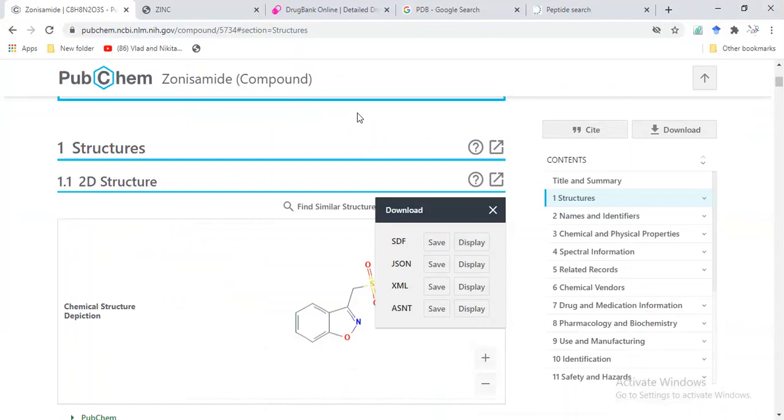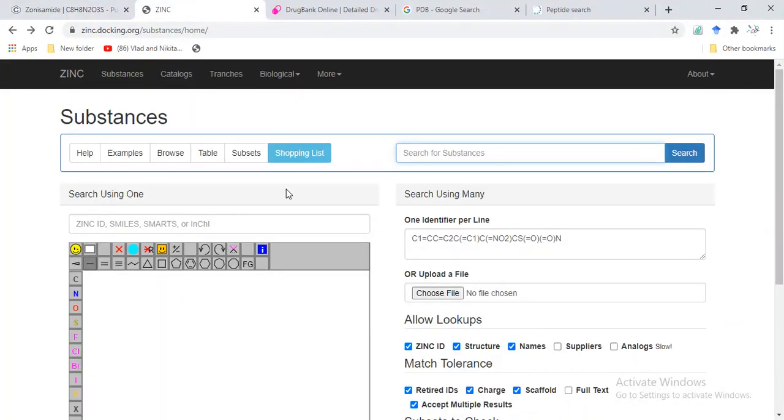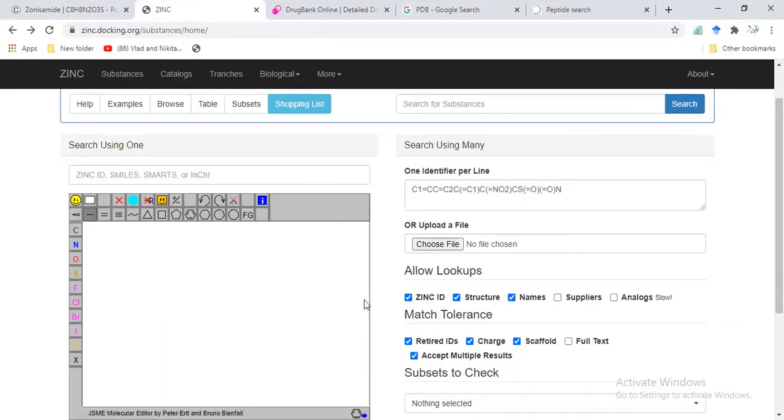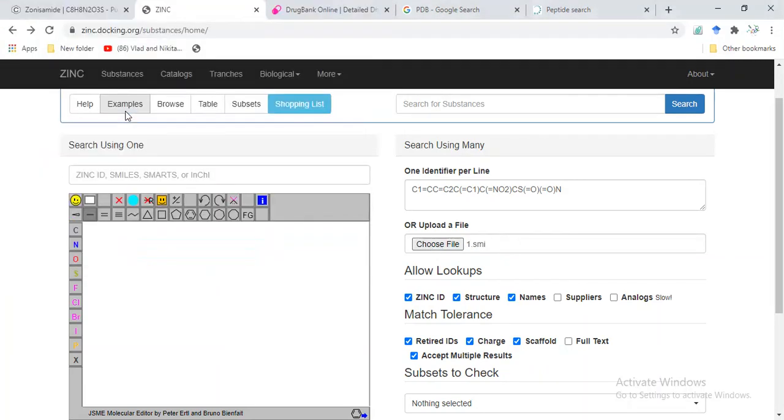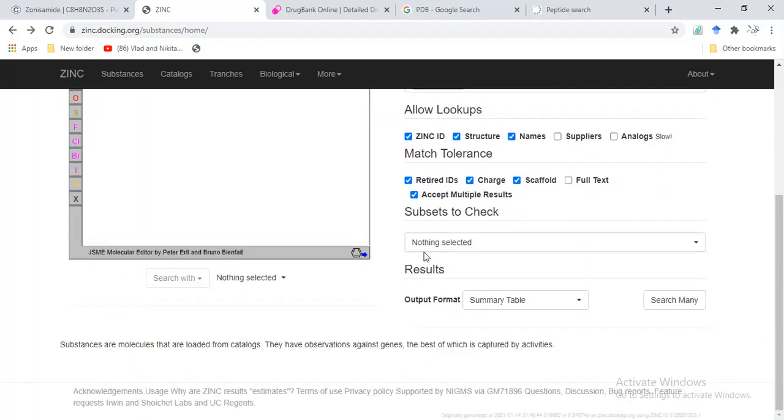We can also search these structures from ZINC database. We can upload a file—for example, I am going to upload this file which I have saved in SMILES format. Now I am going to search.